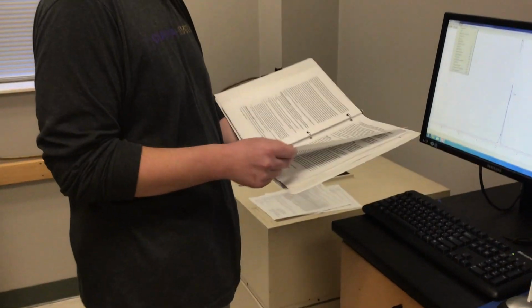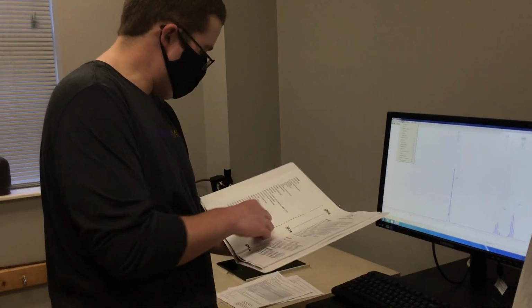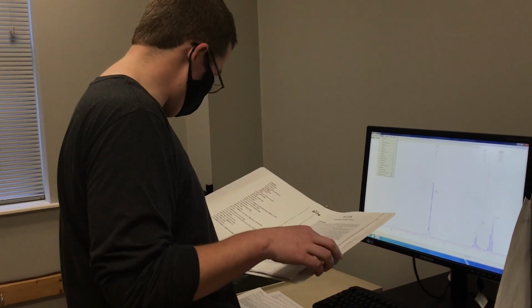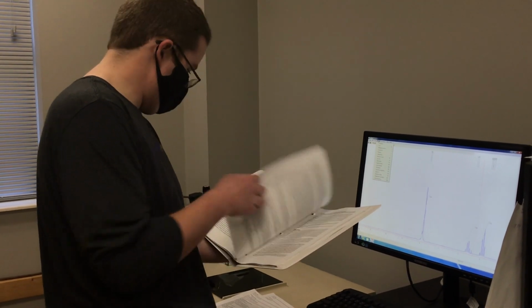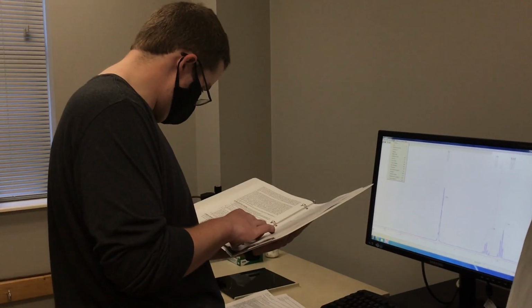You just have to look in the right place, I think there's an index actually, or a table of contents. And so it can tell you exactly where you need to go to figure out what code you need to add in here. So I would look under integration, which is on page 11, which should tell me how to bring everything up to the next common multiple. Let's see if I can find it.